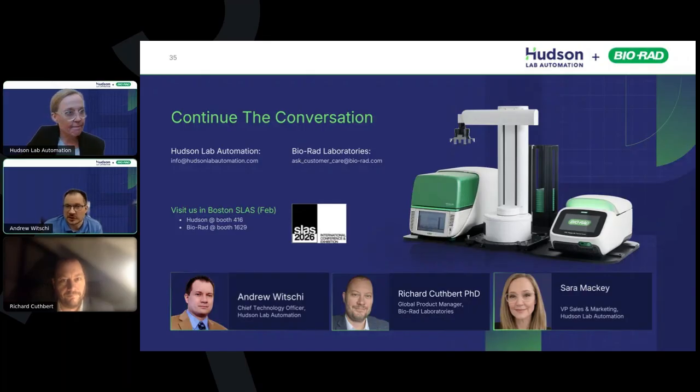Yeah, the answer there really comes down to what problem are we trying to solve, right? If we're talking about flow cytometers as an example, usually you're talking about pretty long reads, right? Because some of the biggest gains in flow are going from not having an autosampler to having an autosampler, right? And when we're talking about an instrument like the ZE5, we're talking about a very capable instrument that is much different than what was available 10 or 15 years ago. You can read 96 samples at the same time, totally hands off, and that might take you, depending on the flow cytometer you're talking about, anywhere from tens of minutes to many hours.